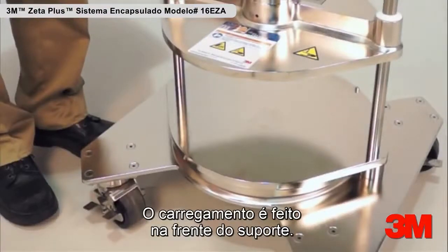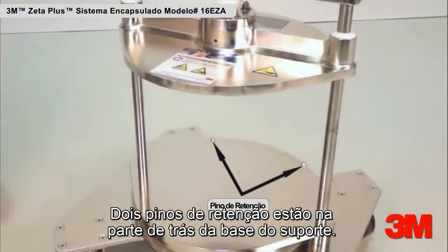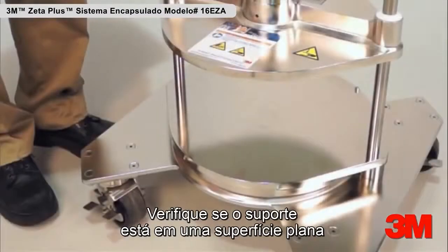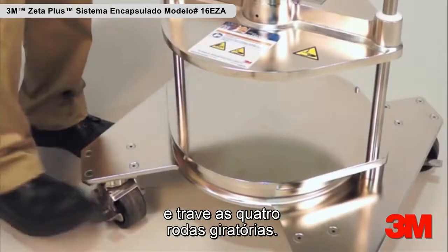Loading is performed in front of the holder. Two stop pins are located in the back of the holder base. Ensure the holder is on a level surface and lock the four swivel casters.